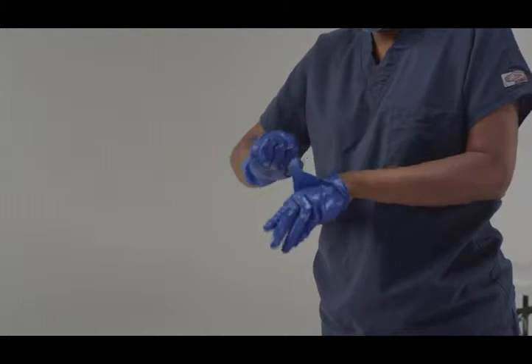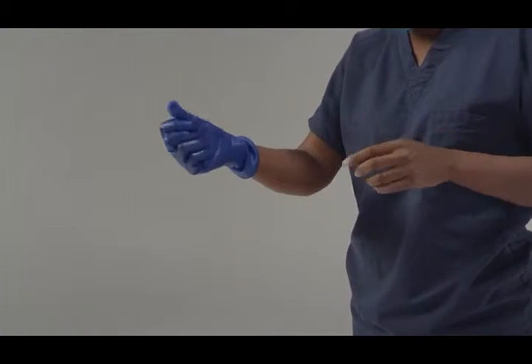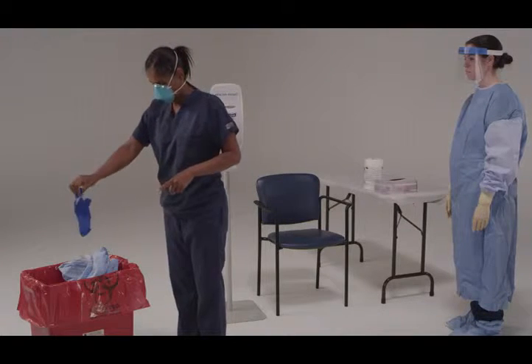Please do this slowly to avoid tearing the gloves or contaminating your hands. It's important that you don't touch your face or any other exposed skin with your bare hands now. Now that your gloves are off, make sure you don't touch your face or any exposed skin.